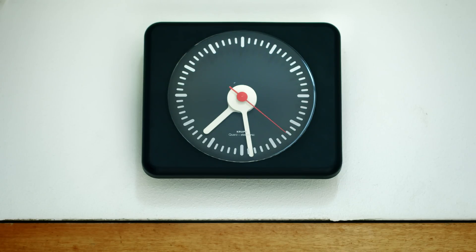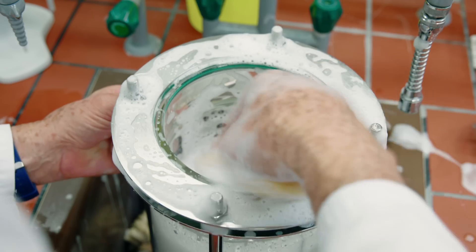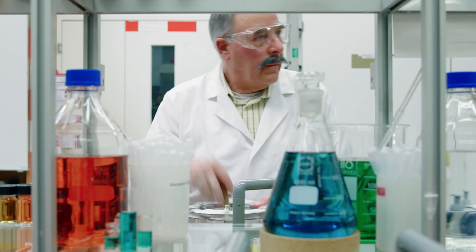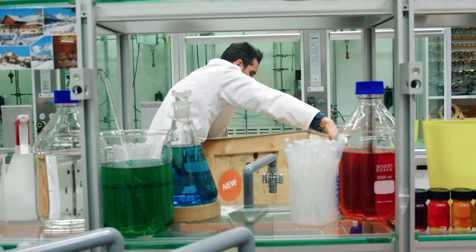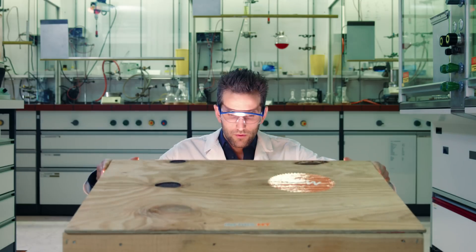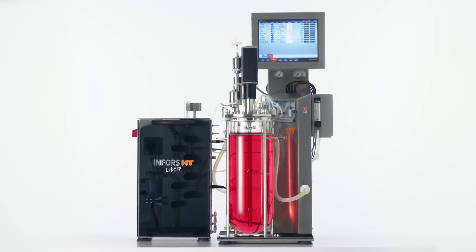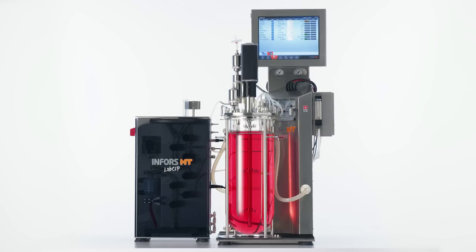Every week, the next cleaning day begins like any other day. The LabCIP cleans and sterilizes the Labfors 5 benchtop bioreactor automatically overnight.